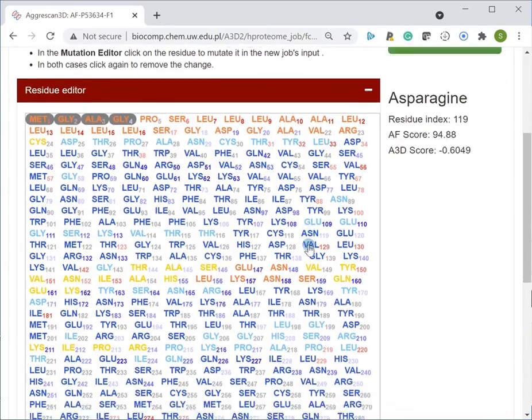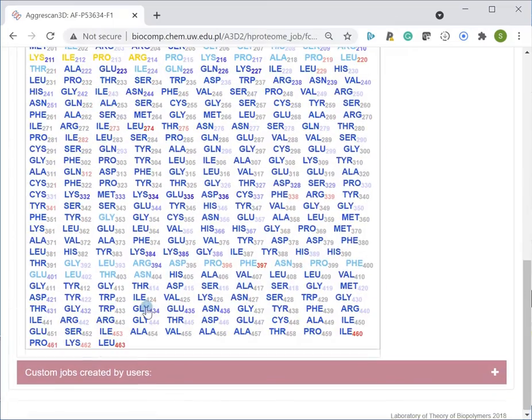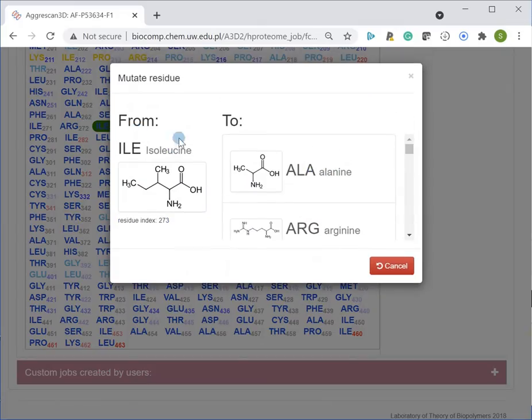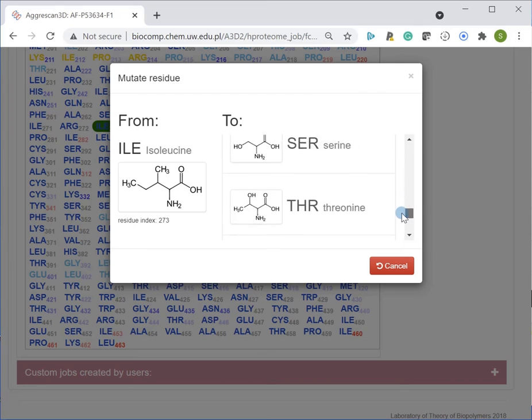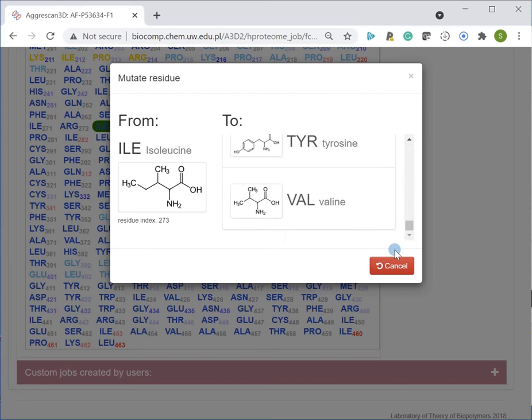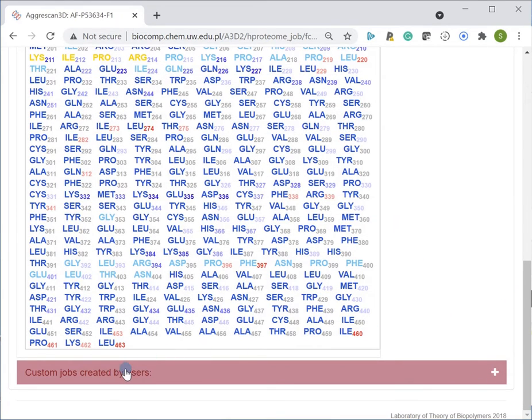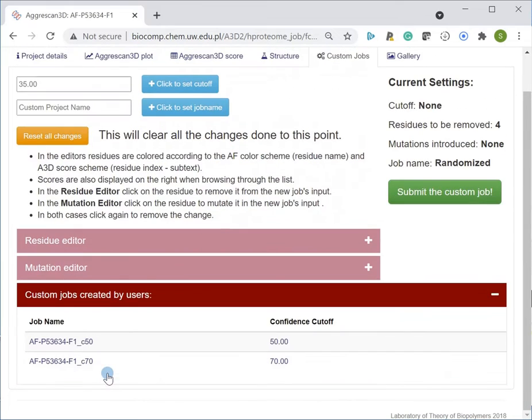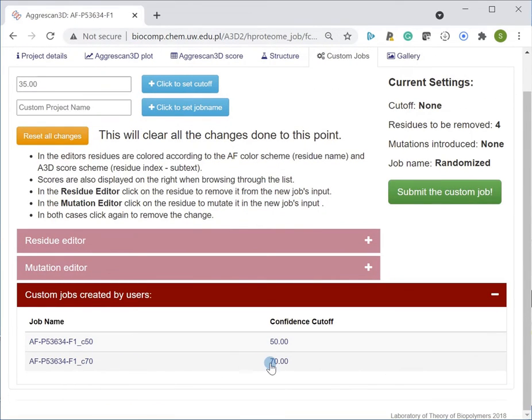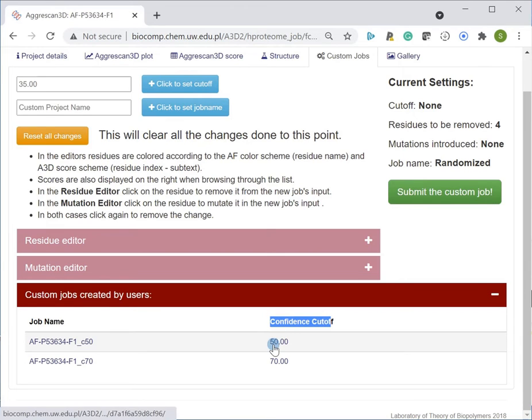The mutation editor allows introducing one or multiple mutations and testing their impact on protein solubility and stability. At the bottom, links are provided to jobs computed for this particular entry with modified input. Each database entry is linked to the analysis of protein structure fragments above two confidence cutoffs: 70 and 50.